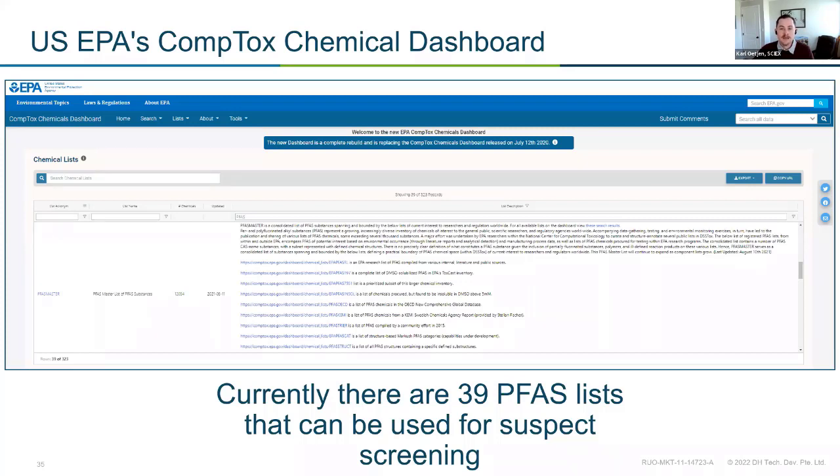And that's great. But one of the things you're probably realizing is that I don't have that library data to lean on. So I don't have that spectral information, right? I've got my formula, which is what I need for a suspect list, or at least a mass. So I can do my mass error. Presumably I have a formula, so I can match my isotopic information. So how do I ever move past that? How do I climb up the pyramid further?